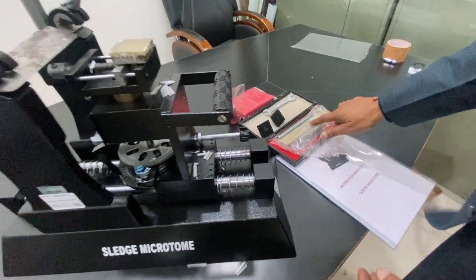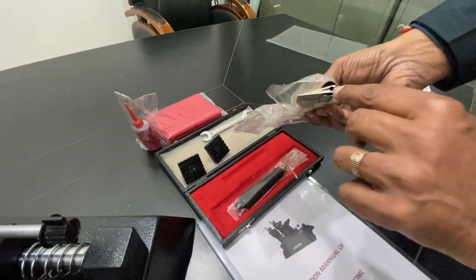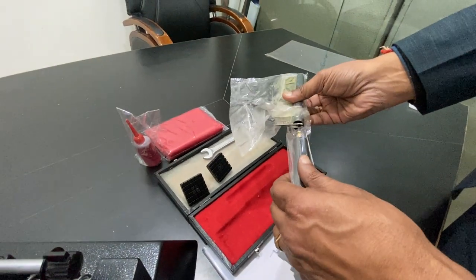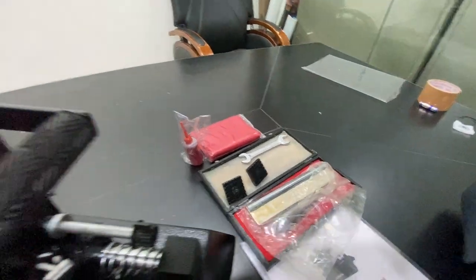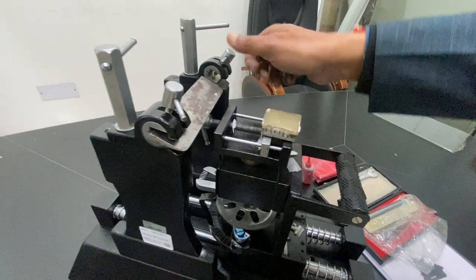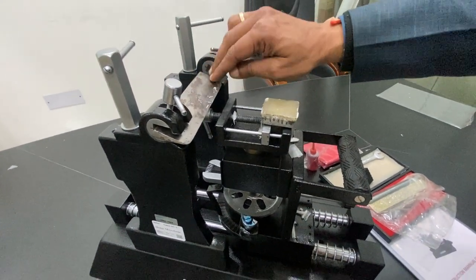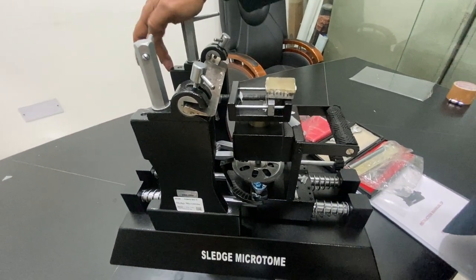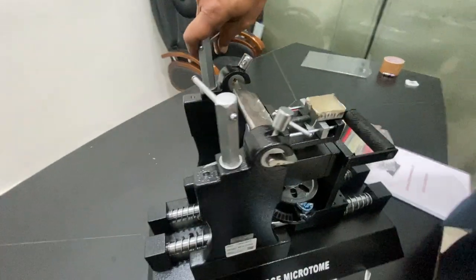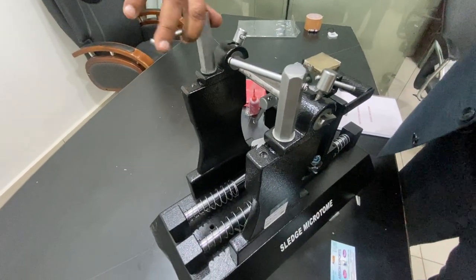This is one blade, which is about 6 inches long, and it has a hole here, and we can put this handle, take out the blade and hold it on both sides. Then we adjust the angle of this blade, as we have already done with our sample blade. And the block holder of the unit can be put back by opening this screw, putting it in this section and then tightening it.